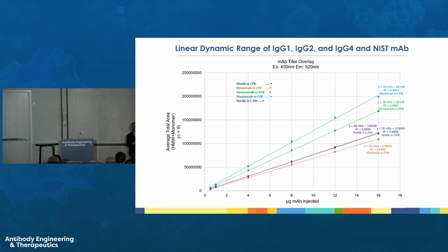The contour is slightly different, and therefore you get a different slope and a different binding affinity. I don't know, we haven't done exhaustive experiments to tell you whether it's universally true that all IgG4s will have the same slope as Nivolumab, all IgG2s will have the same slope as Denosumab. I don't know that. As more and more data comes in, we'll figure that out.